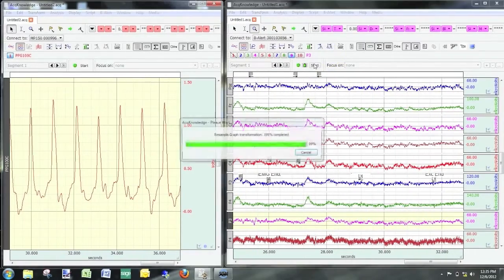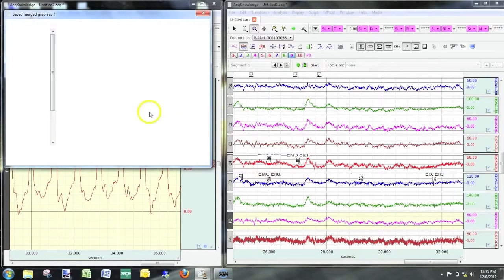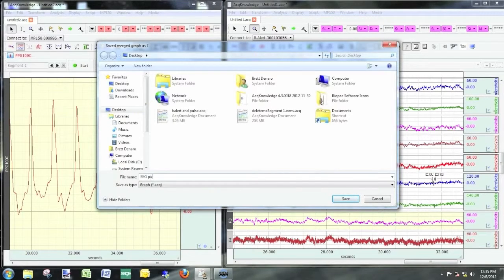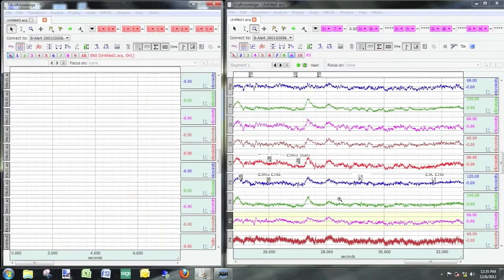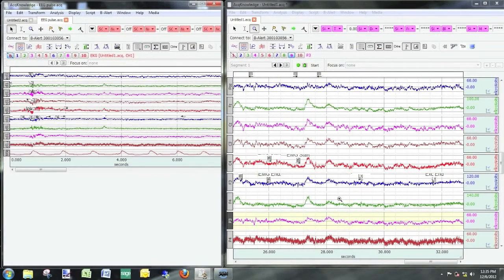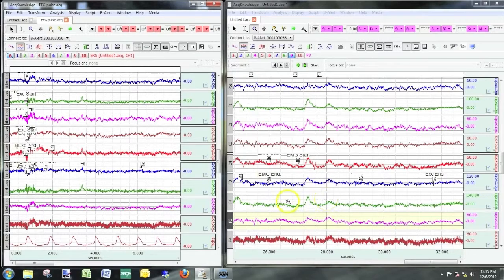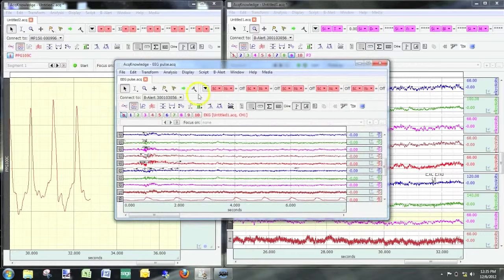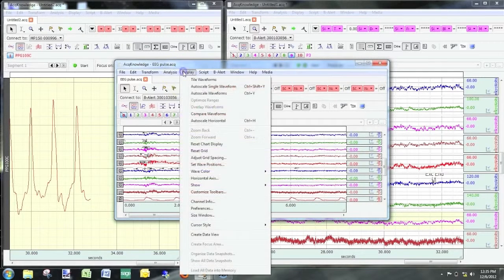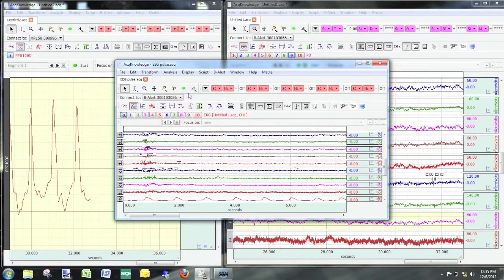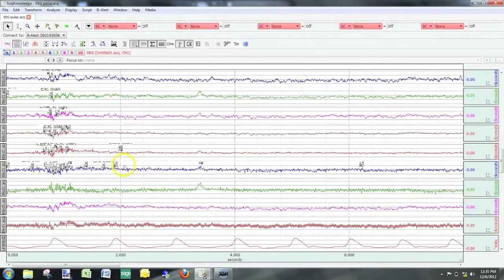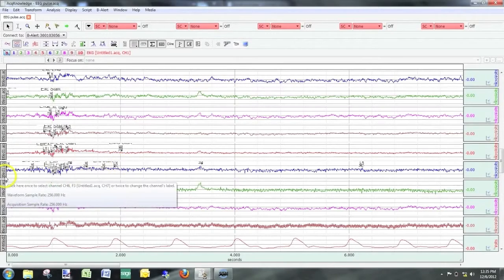When you click on Stop, you'll be prompted to save your file. This will be our merged file. I'll save it to the desktop. Now you'll see our merged graph file is created, and this has both the BeAlert and the MP150 data contained in it. We still have both RAW files on the left and the right, and we have the merged file that contains both the BeAlert and the pulse data.